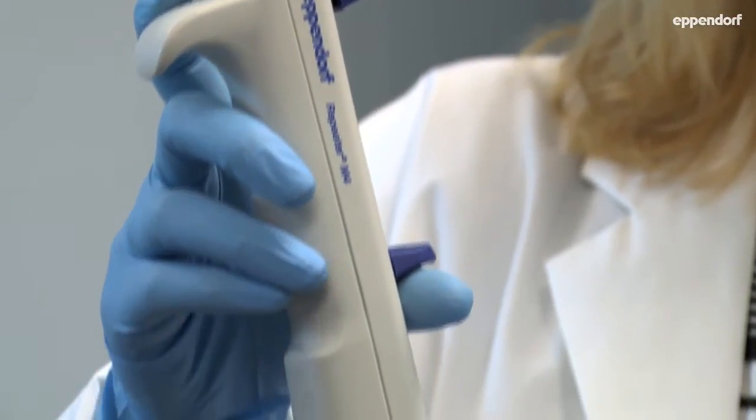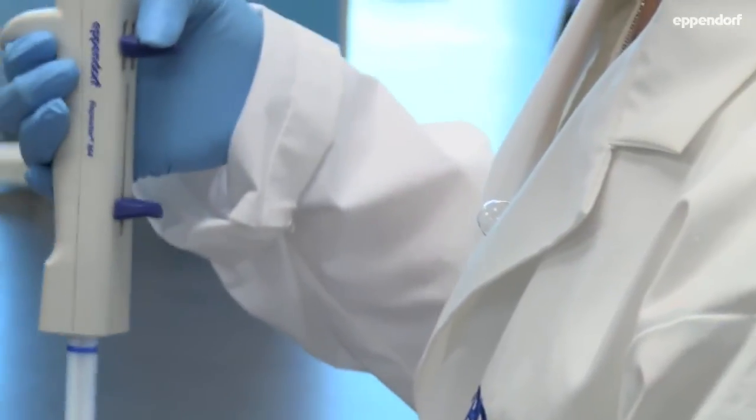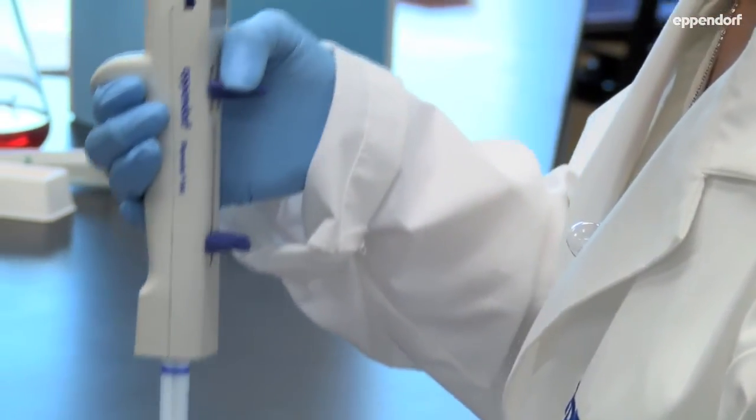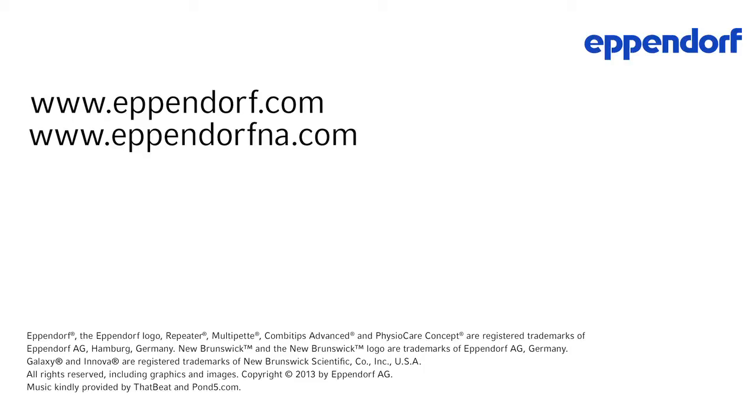Save time and effort. The Eppendorf Multipet M4 offers more than just serial dispensing. Eppendorf puts the perfect instrument in your hands, allowing you to go beyond the limitations of standard pipetting.